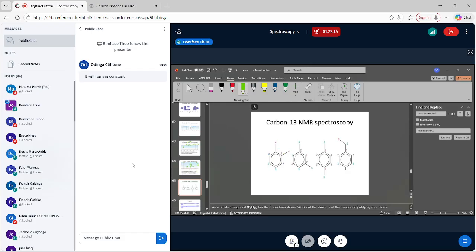Then the 2 carbons which are ortho to the methyl groups and the 2 carbons which are meta to the methyl groups. So what we see is that this first compound gives us a ratio of 2 to 2 for the aromatic carbons, and then 2 methyl groups, which are equivalent. So in essence, this particular compound corresponds nicely to the spectrum that we have.